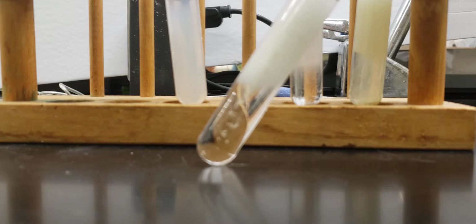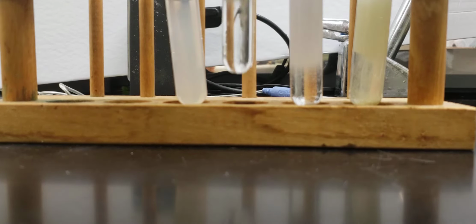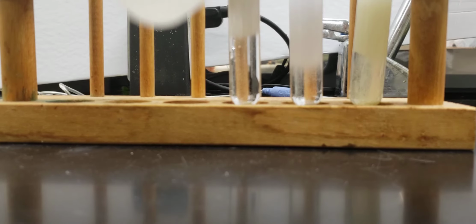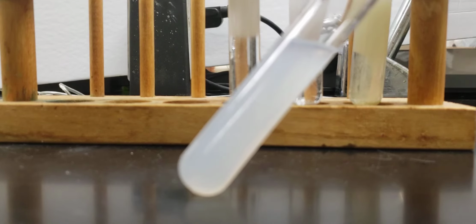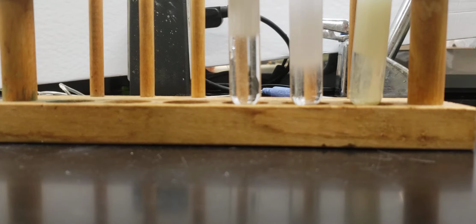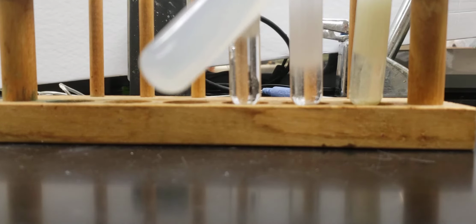Okay, and you can see those particles coming out there. The last one is our city tap water. Okay, and our city tap water, you should notice that this also has a precipitate that's coming out here. It has changed color, and it seems to be closest to our silvery color. So that means that whatever is in test tube Y is going to be the thing that's also in our tap water.